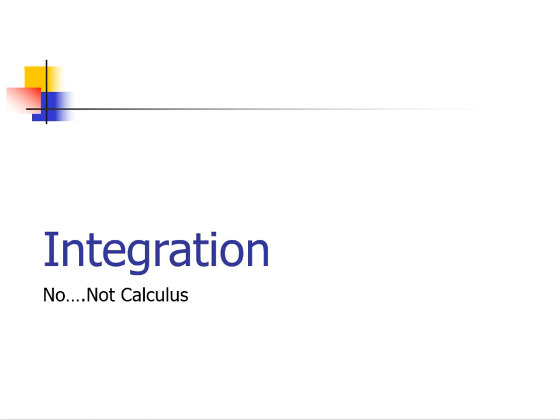I mean, right now you might be feeling pretty good about yourself. Like, NMR, I got this stuff, right? I mean, the number of signals and the electronegativity values, how hard can this actually get? Well, you're getting ready to stumble in the world of integration and splitting. We talked a little bit about splitting, but not much. And we're going to have to look at this integration first before we go into splitting. And you're going to start to see the complicated world of NMR open up petal by petal by petal.